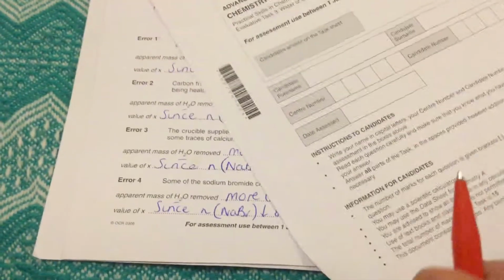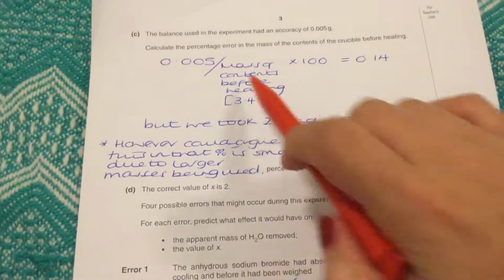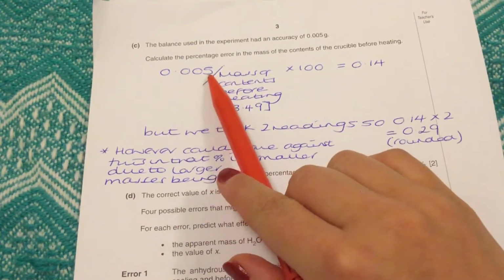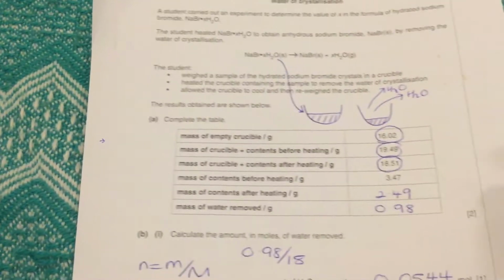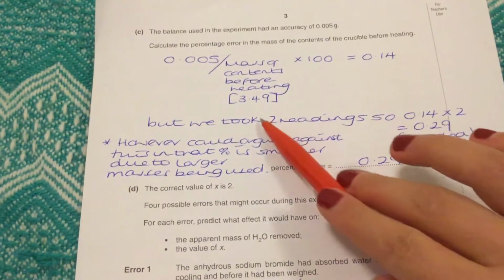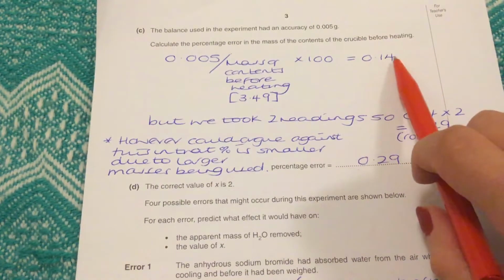From there, we then move on to a calculation of error. Now here what we're taking is the uncertainty that we have in the apparatus, 0.005, and we're dividing through by the mass of the contents before heating, which we are taking from the table just here. Oh, that should be 3.47, not 3.49, and multiplying that by 100, which gives us 0.14.